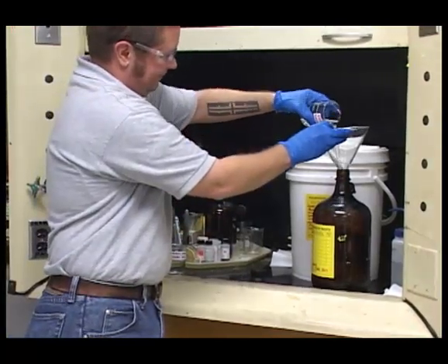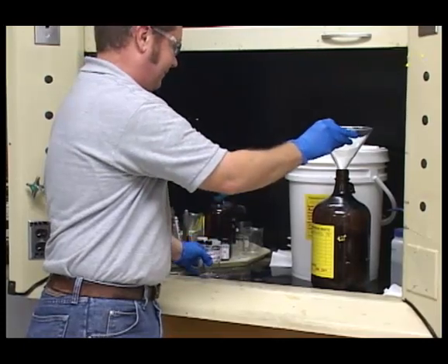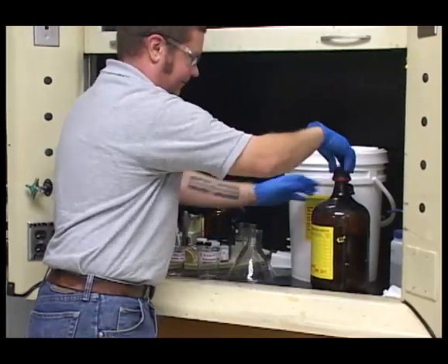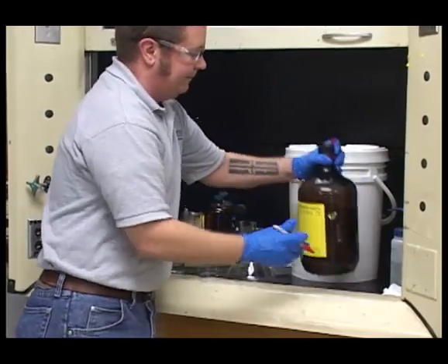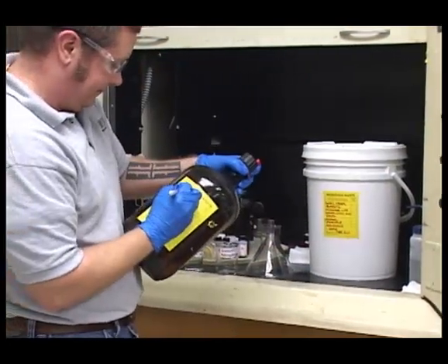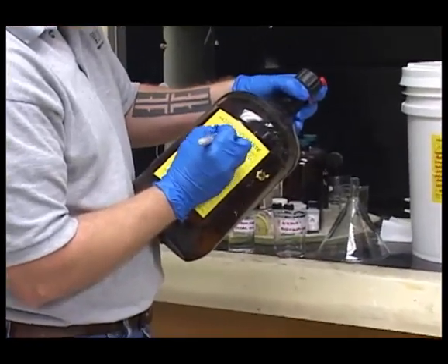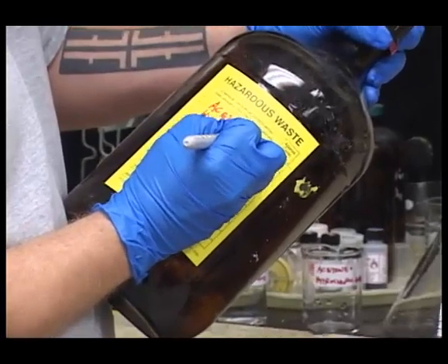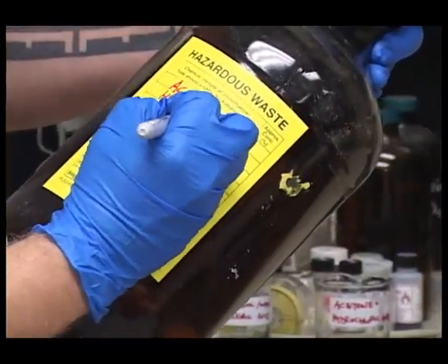If, for example, today, let's say you are going to start this new waste collection container, and you have a combination of acetone and hydrochloric acid to dispose of. You dispose of your solution into this empty but already labeled waste container, close the container, and then add acetone and hydrochloric acid to the label.